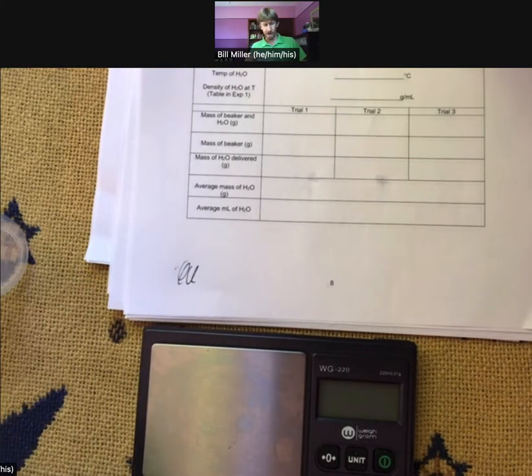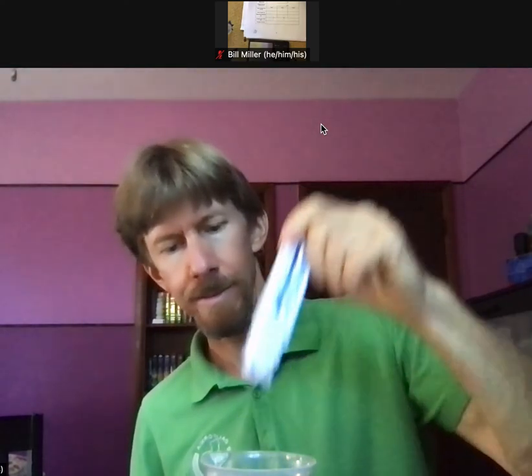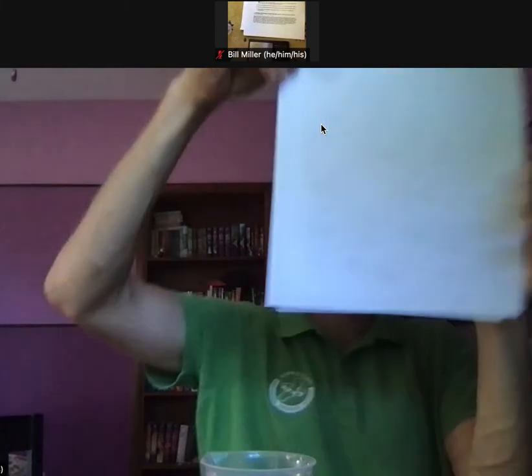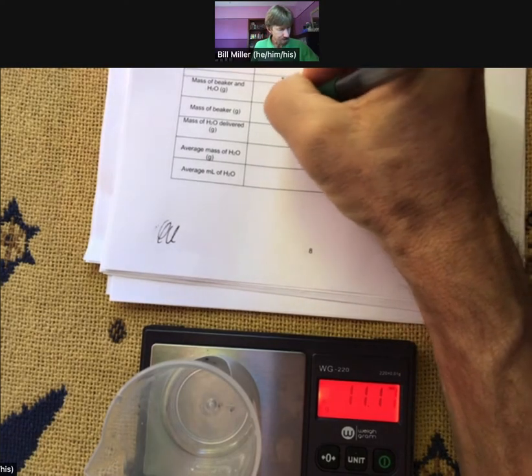Before I proceed, let's do our temperature — it says 19.7 degrees Celsius. We have that density already: 0.998265.